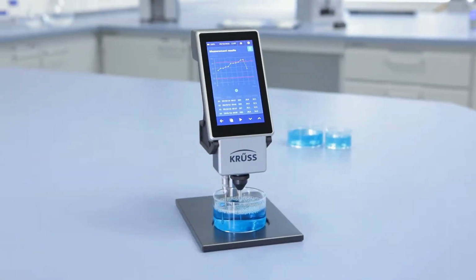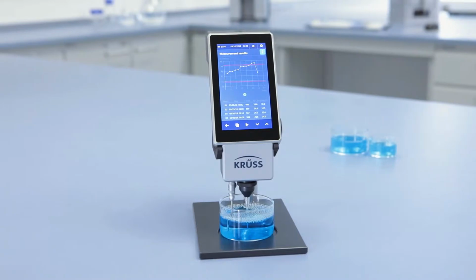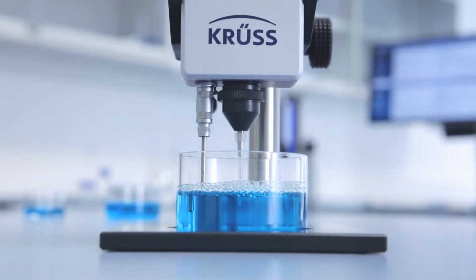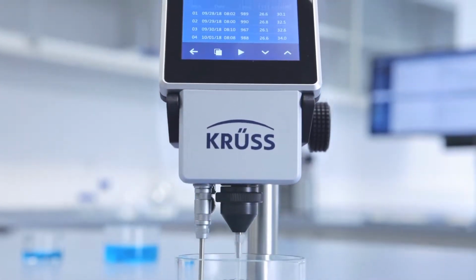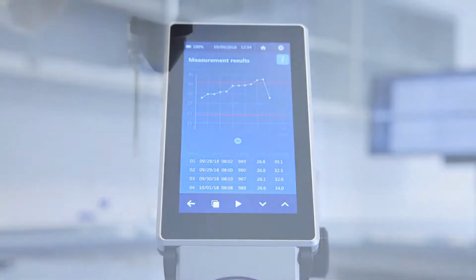Introducing the Kruss Bubble Pressure Tensiometer, BPT Mobile, which gives you the results you need for superb quality control in a matter of seconds by precisely measuring the dynamic surface tension of your baths. On site, on the go, and without the need for a PC or tablet. See how easy it is.